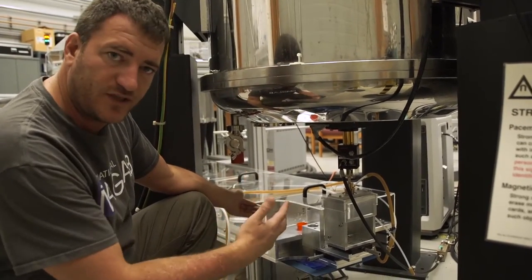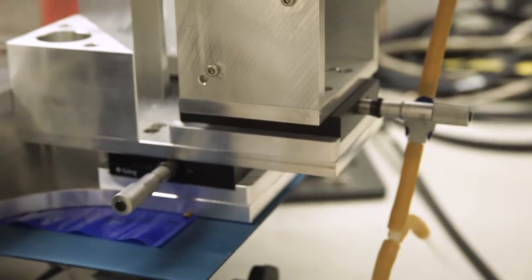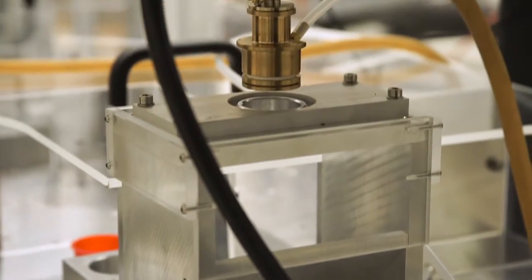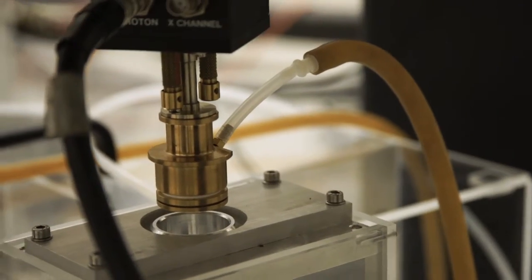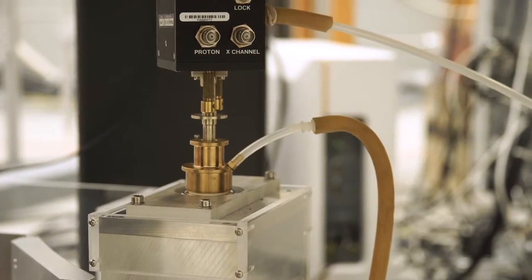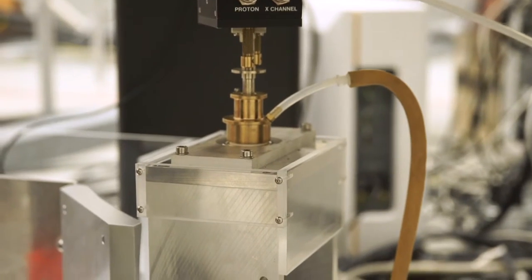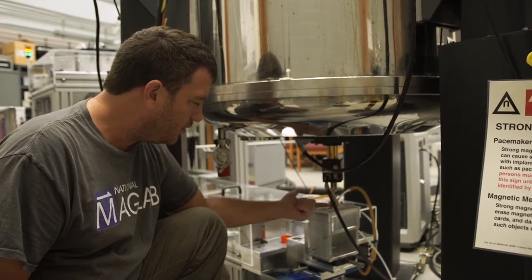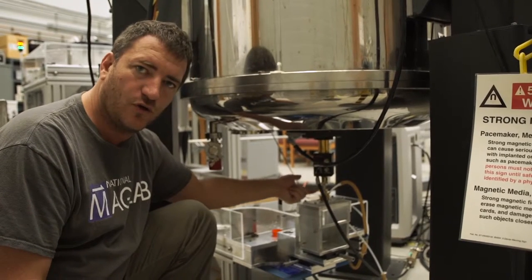The quasi-optic bench serves both for controlling beam polarization and beam power, and also for transmission via a series of mirrors with near-zero losses. At the end, a series of mirrors controlled with micrometer precision projects the beam upward into a corrugated waveguide inside the probe, all the way to the sample. In addition, we've added a system that pushes air into the waveguide to control the sample temperature, maintaining a lower temperature since the microwaves tend to warm up the sample. A window in this piece serves as transmission for the microwave while directing the airflow up through the waveguide.